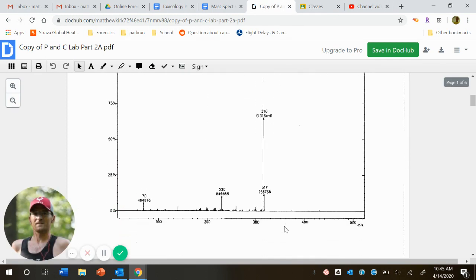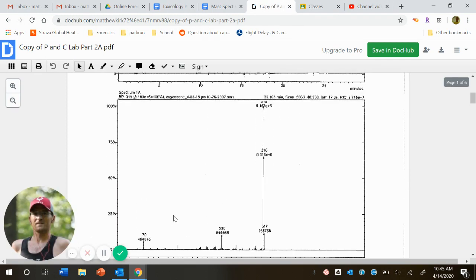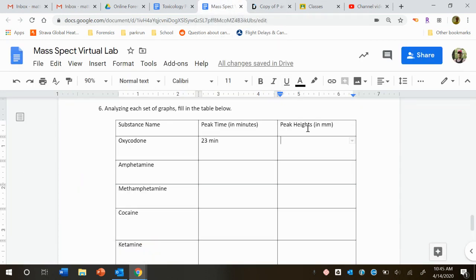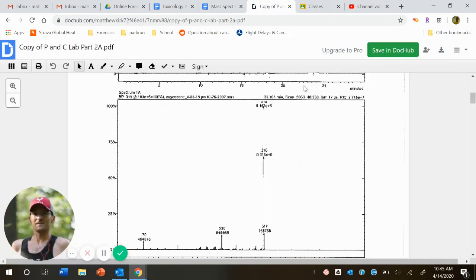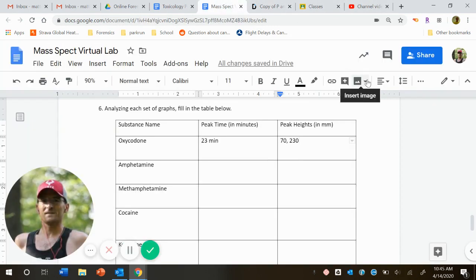And then as far as the peak heights for oxycodone. Okay, we have a number here, we have 70, it looks like 230. So I'm going to put those down. So we have a peak at 70, 230, and what, 315, 316, and 317. So I'd go 315, 316, 317.